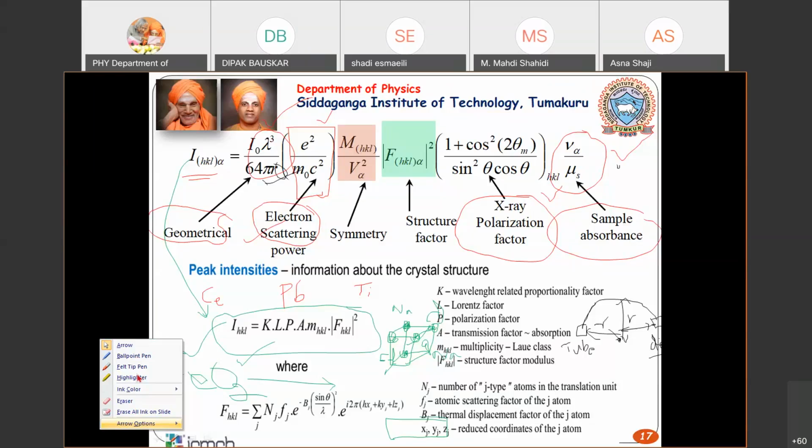Okay, so these are the different space groups that are given here, starting from your cubic, which is Fm minus 3m. If I say Fm minus 3m, then what happens? F refers to face centered. Let me check. Okay, I think it's not there.